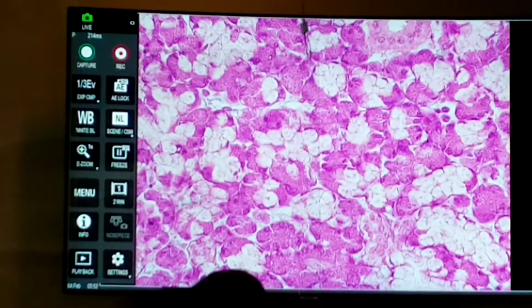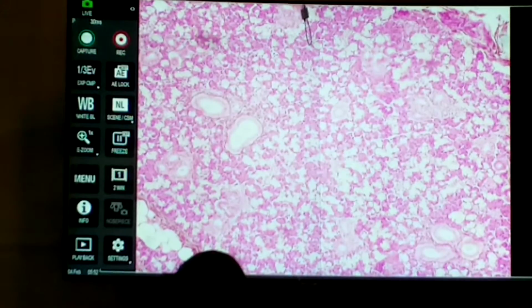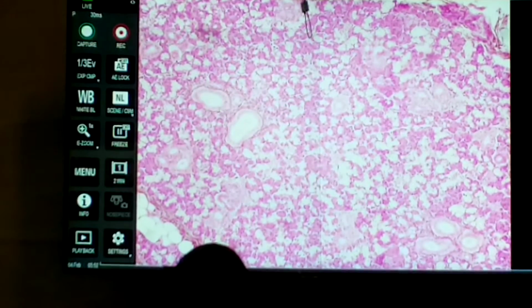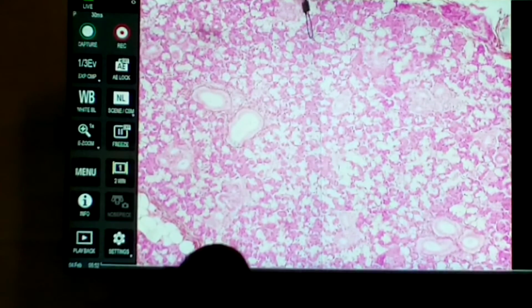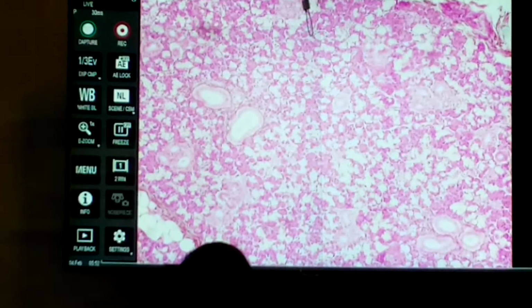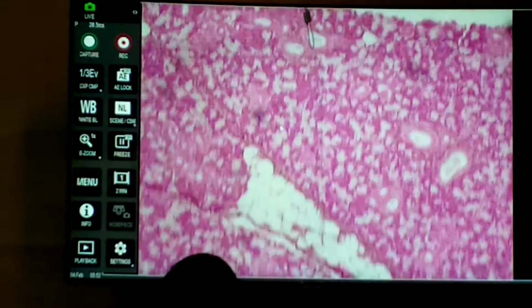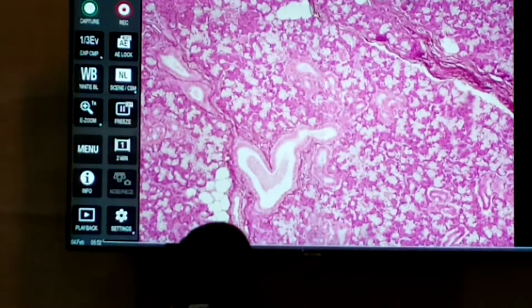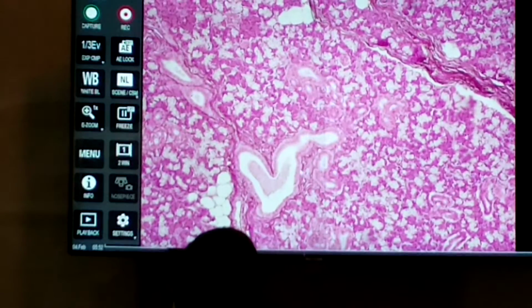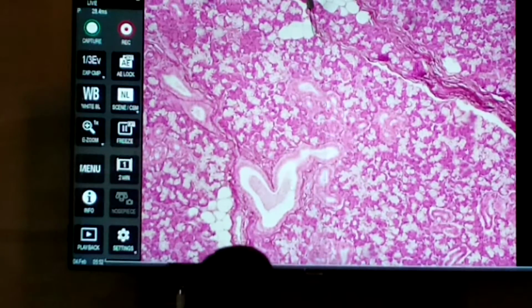This is going to be a duct. So these larger structures here lined by a thicker epithelium, these are ducts. And that particular duct looks like it's surrounded by a simple cuboidal epithelium. If it gets a little larger, it may become columnar. Here's a larger duct here. This one looks like it might even be cuboidal to columnar. And that's just some secretory debris.